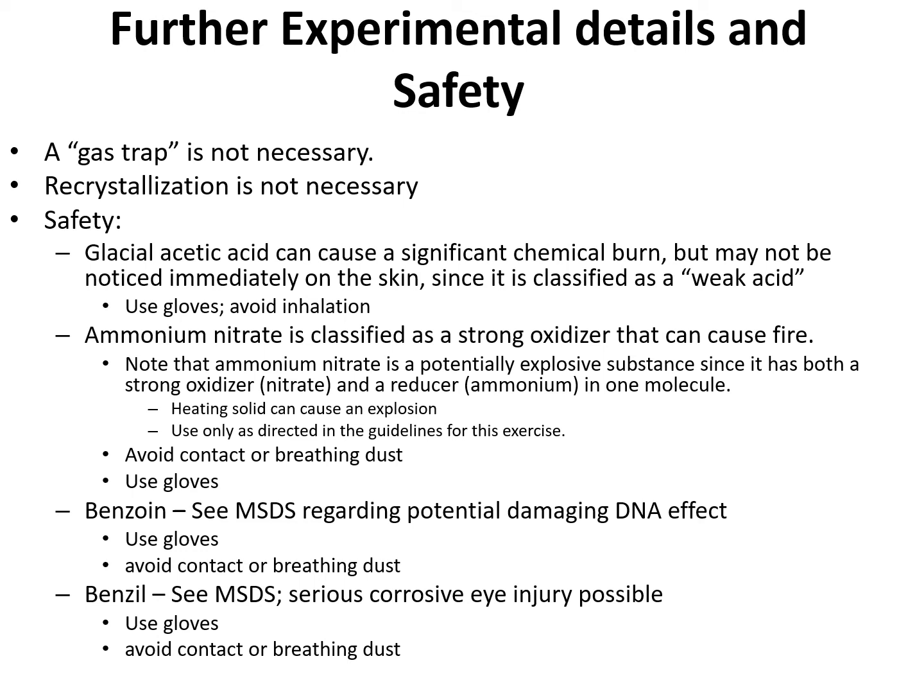However, it's not the purpose of this experiment to trap that gas, and you don't need to do the trapping. Also, the crystal we get from here is pure enough to do further experiments, and if you think maybe to do recrystallization for the sake of purification, you don't need to do that in this experiment.